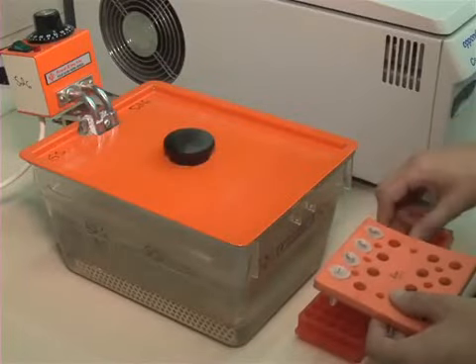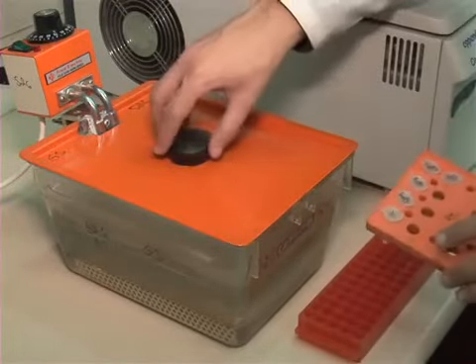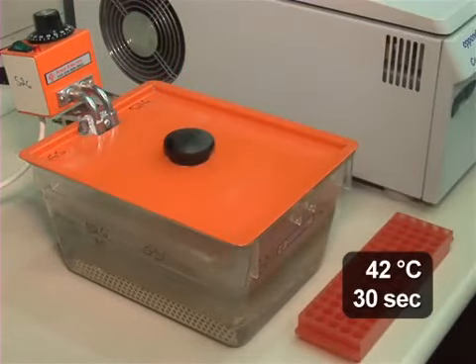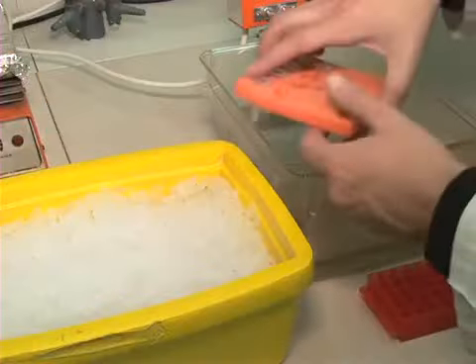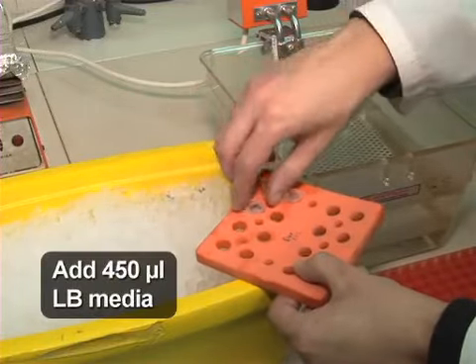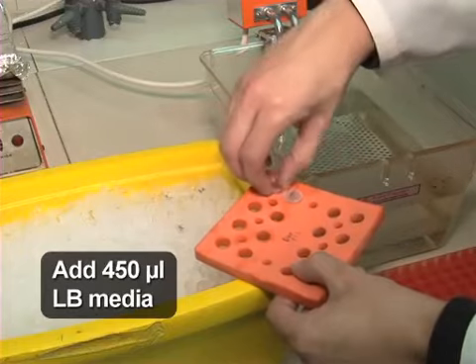When time is up, heat shock the cell and plasmid mixture by placing it in a water bath at 42 degrees Celsius for 30 seconds. Immediately after taking the tube out of the water bath, put it on ice and add 450 microliters of media.